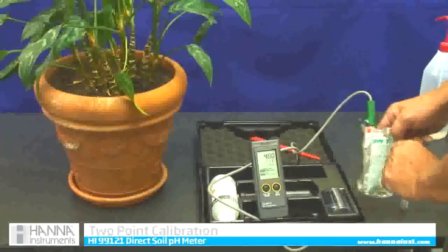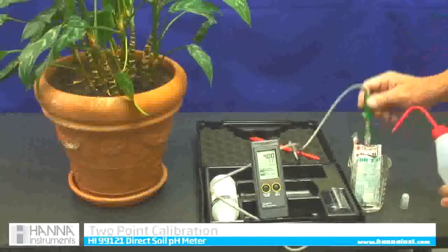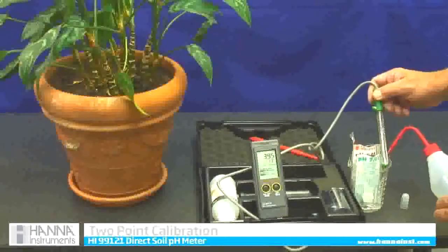It says OK, two points. I am just going to rinse it off with a little bit of clean water.